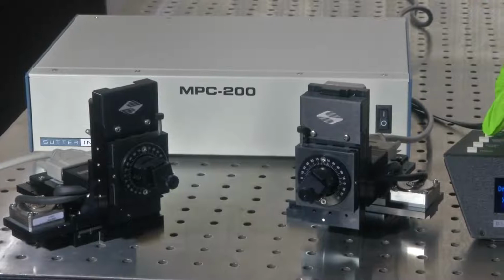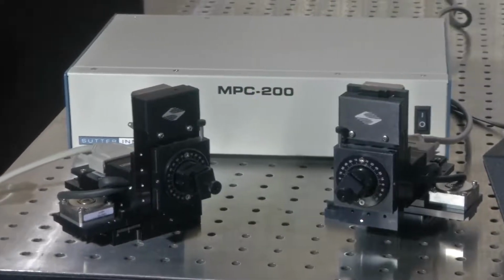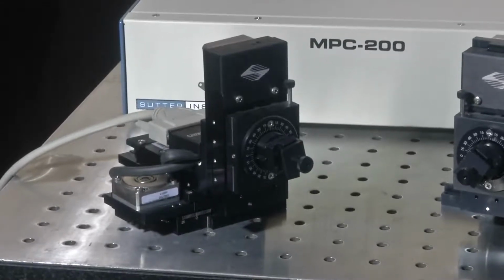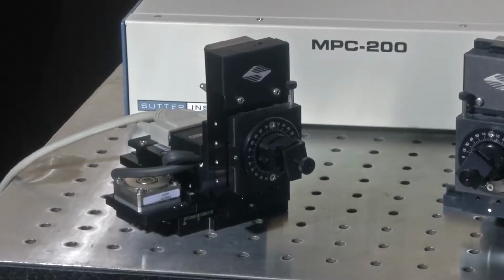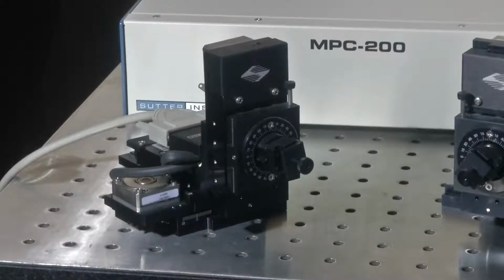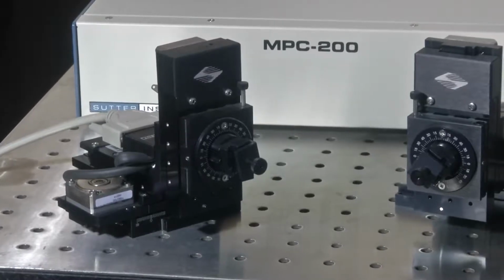And now, if I switch back to my work position, like you could see, it is moving in all 3 directions to the set value, the value which is saved here. So, this comes very handy when you want to save your work position, go back, and when you return you still have the position saved. It would really save a lot of time while you do your research, and it gives more precise results as you want to work on the same sample at the given location.